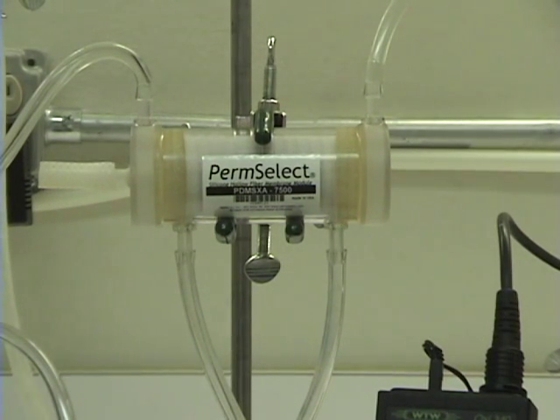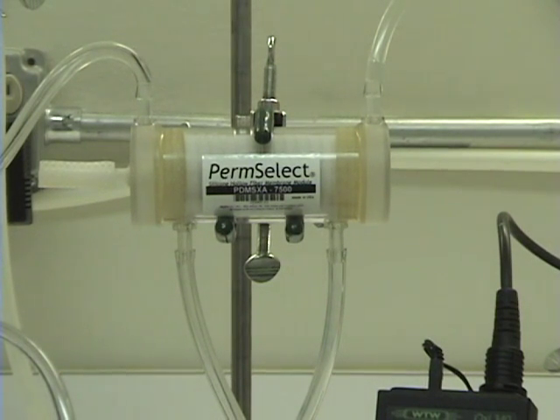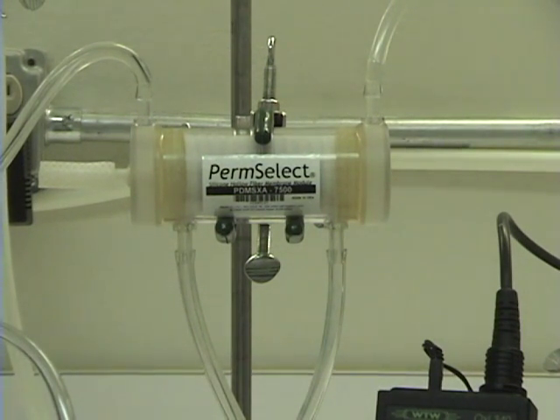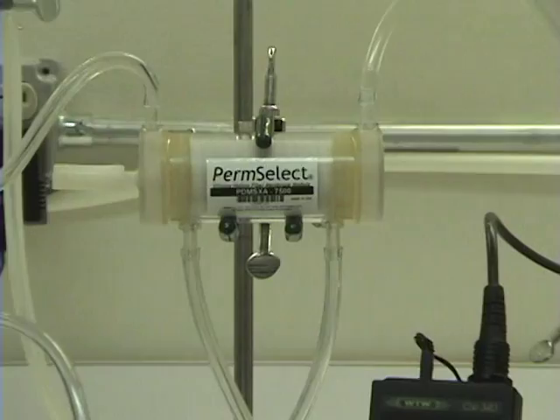This video demonstrates how easy and straightforward it is to degas your liquid stream using a PermSelect membrane module. Shown here is a PDMS XA-7500 module with a surface area of 0.75 meters square.